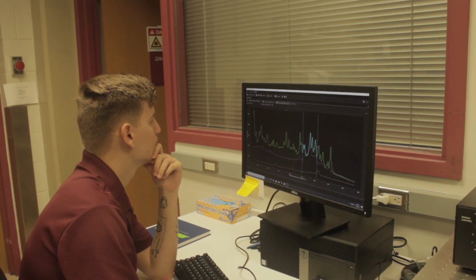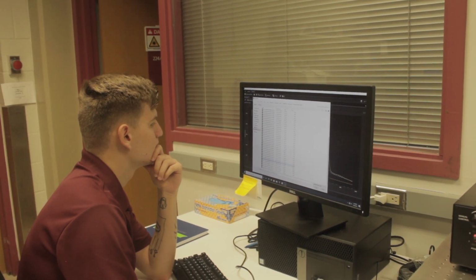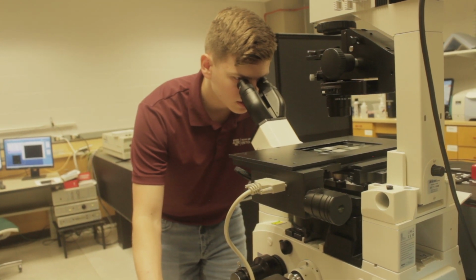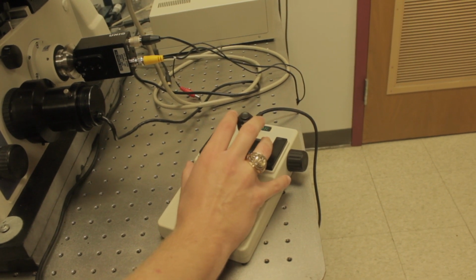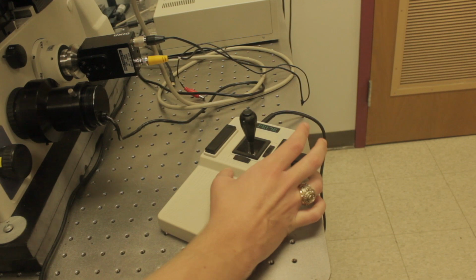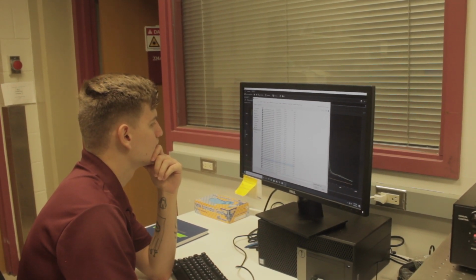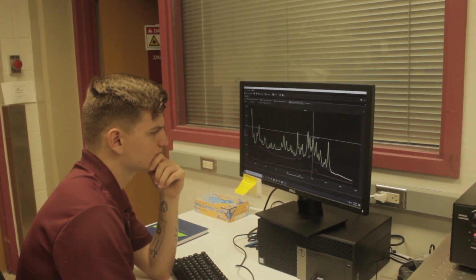Today, we're scanning dyed hair using surface-enhanced Raman spectroscopy, a technique that utilizes plasmonic solutions like gold nanoparticles to increase the number of scatter events. Our Raman spectra have two variables: the intensity, which is directly proportional to the number of photons collected, and the Raman shift, which is a derivative of the different wavelengths photons are scattered at. In this scenario, we can tell that wavelengths are longer than the original since our Raman shift is positive, indicative of Stokes scattering. The other benefits of using confocal are that we can change the Raman shift to wherever we like, as well as adjust the power of the laser that reaches our specimen using filters.